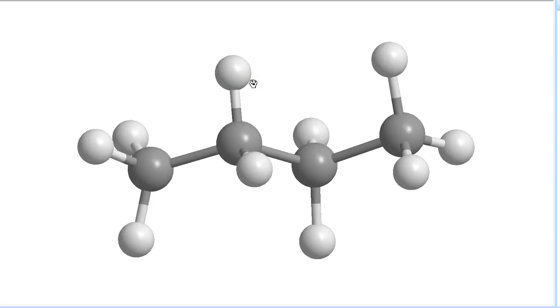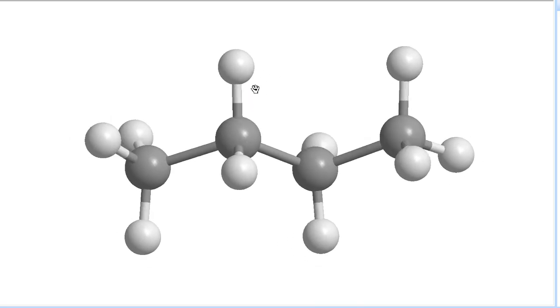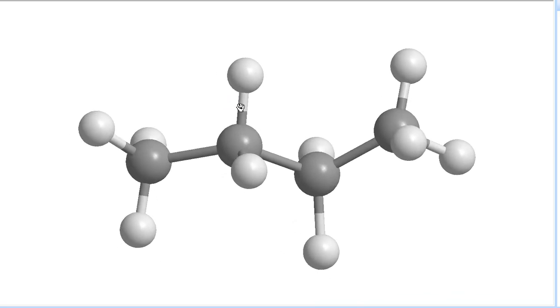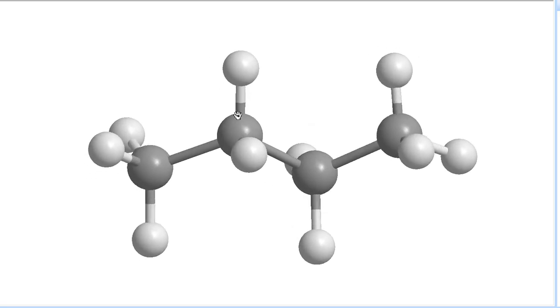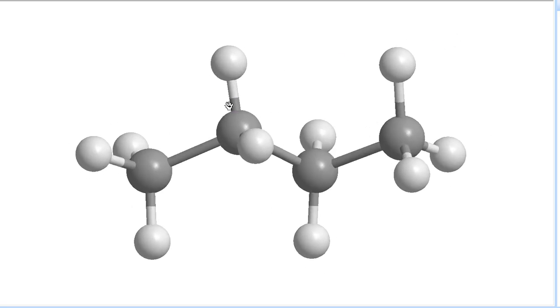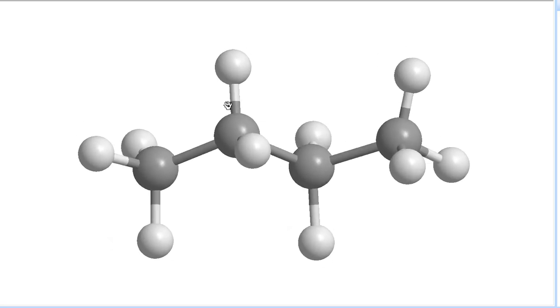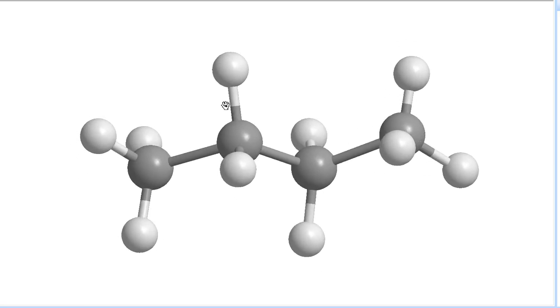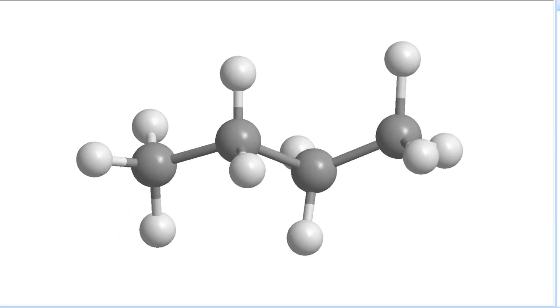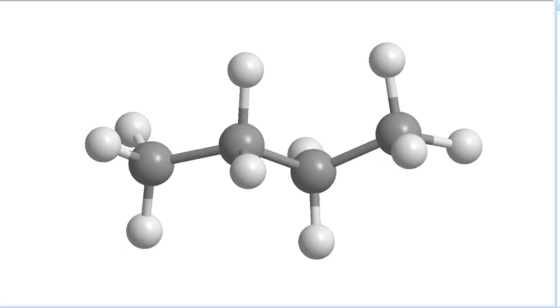as their bond angles deviate from the ideal, the bonds get shorter and longer, and all of these motions of atoms relative to each other in the bonds translate to energies that are present in the infrared region. So they correspond to colors, if you will, of infrared light.